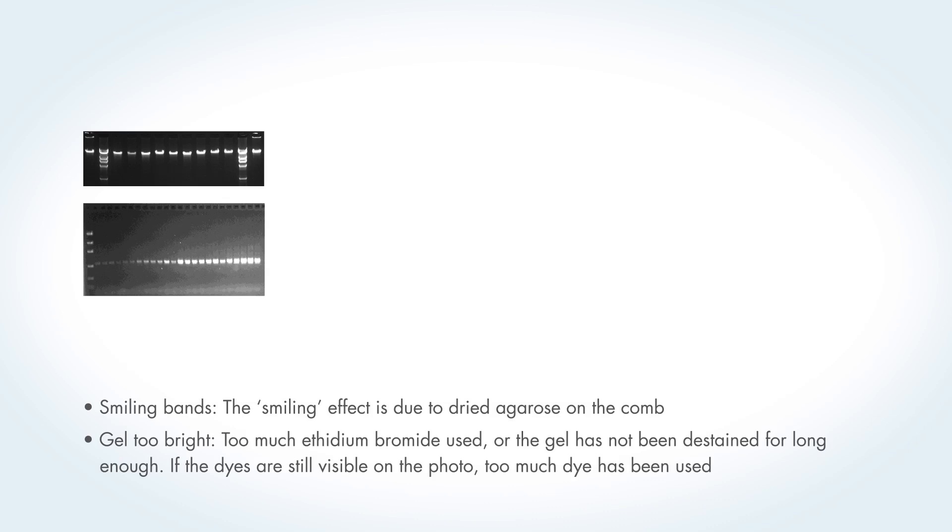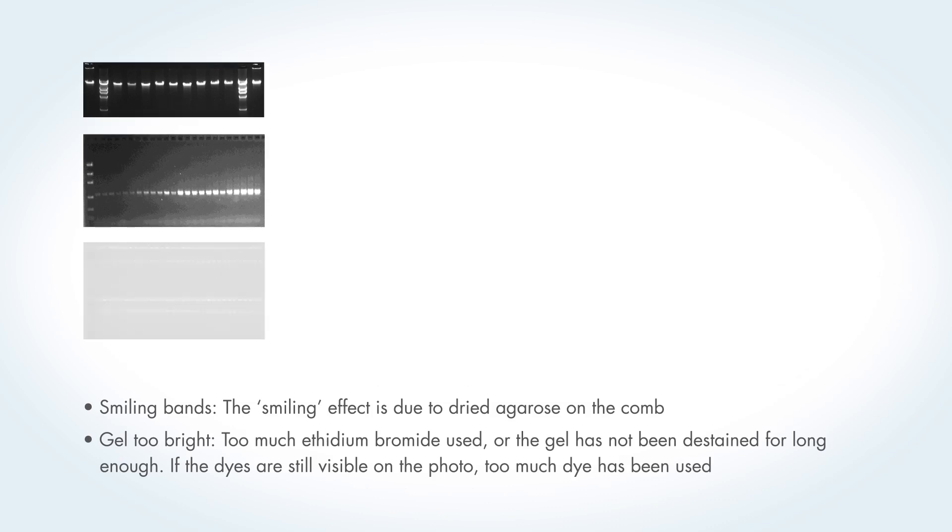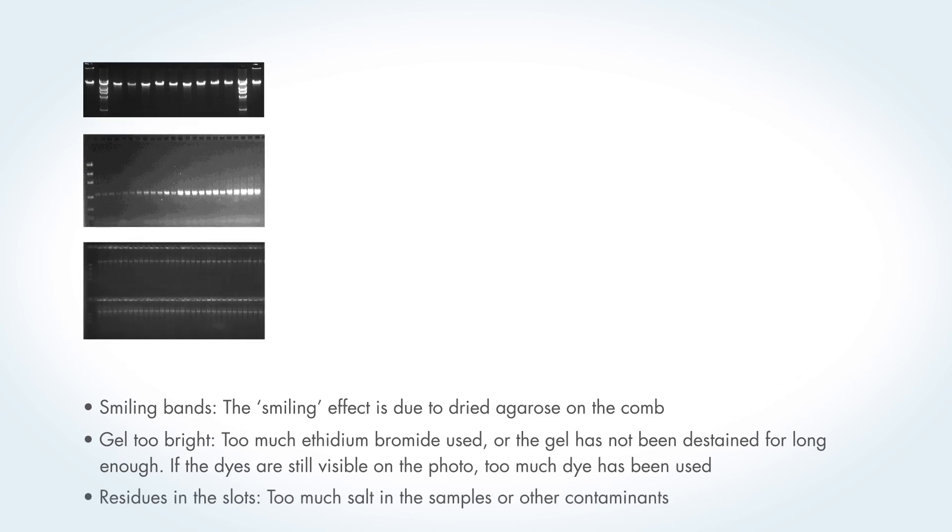One more effect can be seen in the second photo. The two dyes used are visible, and this indicates that too much dye has been used. This can be distracting when the DNA band has the same position as the dye. In the bottom photo we can see residues in the slots. These are caused by too much salt or other contaminants in the probes.